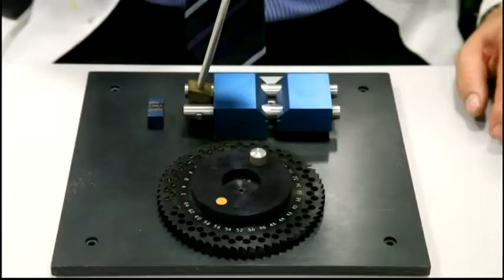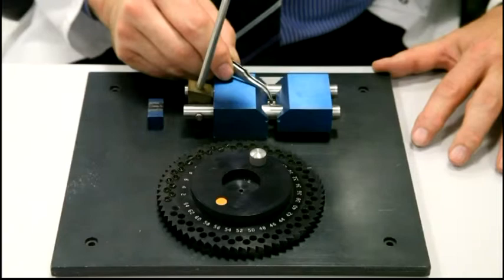Once weighed, the samples are placed into a protective nickel sleeve in the 64-position sample wall prior to analysis.